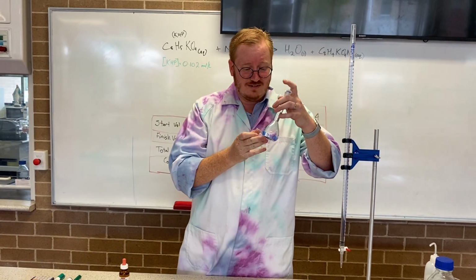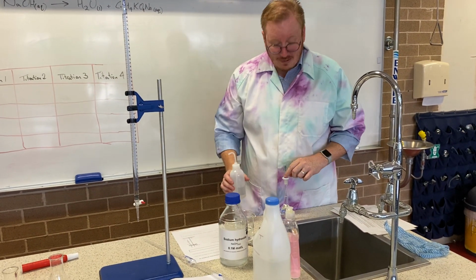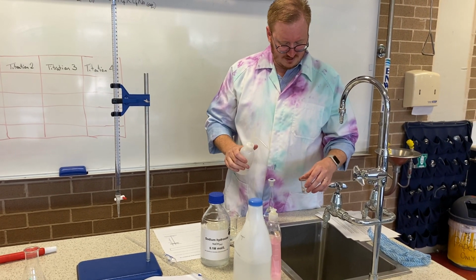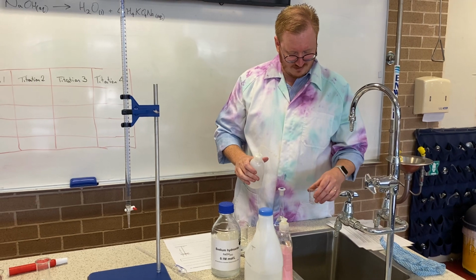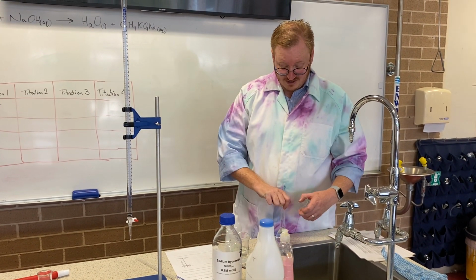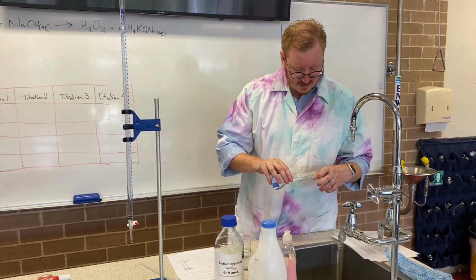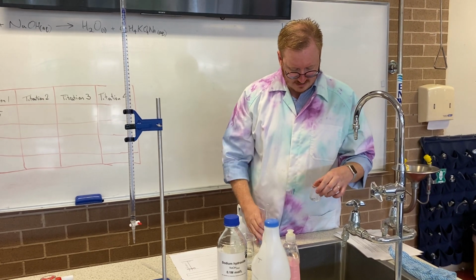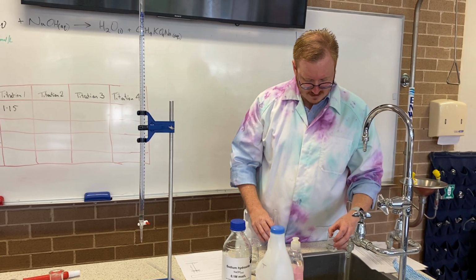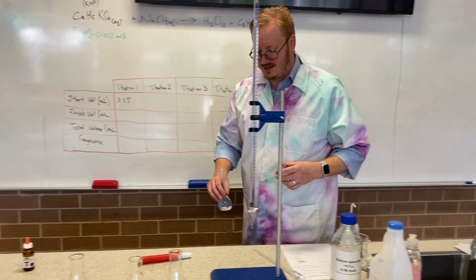So this little beaker that I'm going to put some KHP solution in, because I don't want to pipette straight out of my stock bottle there, because I don't want to contaminate it, even though I'm using it all in this instance. Twice with water, and I don't want to dilute it, so I'm going to rinse it with the solution that I'm putting in there. A little bit in the bottom, let it glug glug. It's only low concentration and I can spill it about a bit.